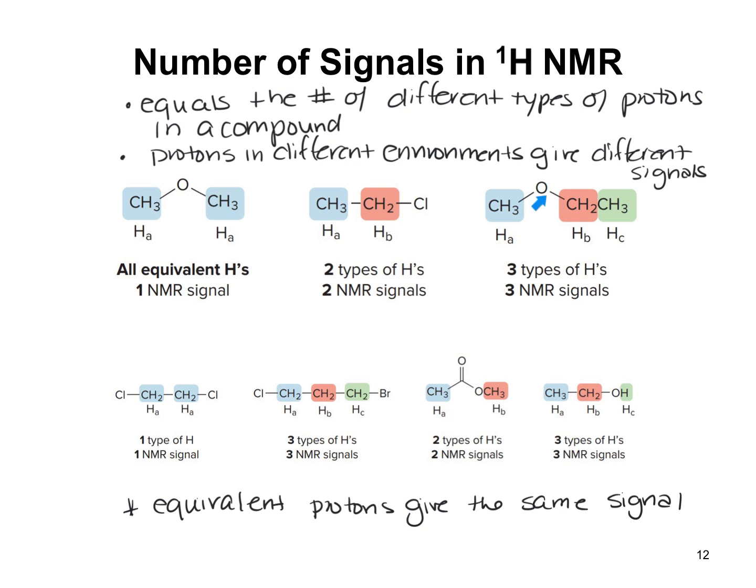When you come over here, right, you have the CH3 here, and that's going to give a different signal than the CH2. They're the same distance away from the oxygen, but they're in different chemical environments because this CH2 is attached to this CH3 here. Okay, so they're in different environments there.